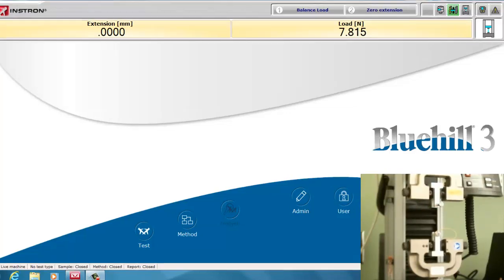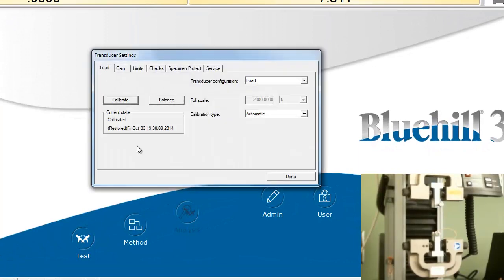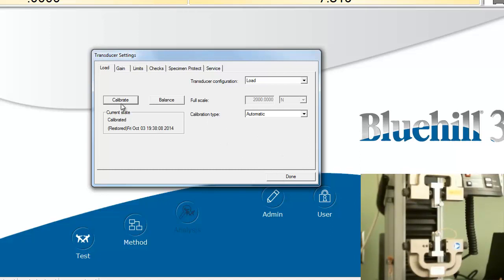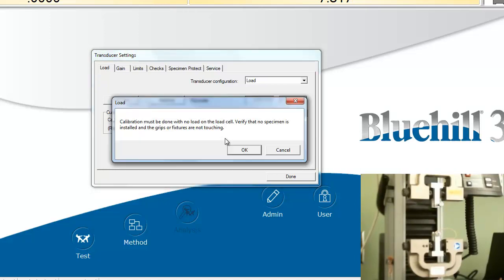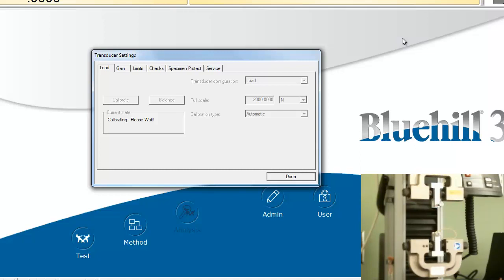As usual, when you get on the Instron, you need to calibrate the load cell when there's nothing on it, except for the grips, as you can see from the video. This only takes a few seconds. It also balances the load transducer, as you notice in the upper right, as it's calibrating, there's just dots, and they will be zeroed at the end of the calibration.